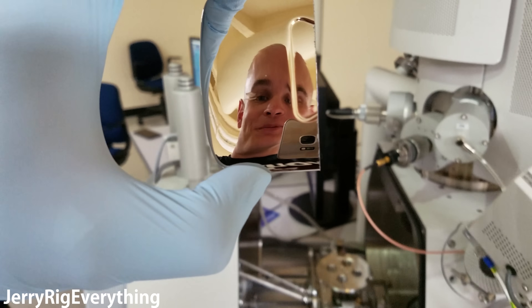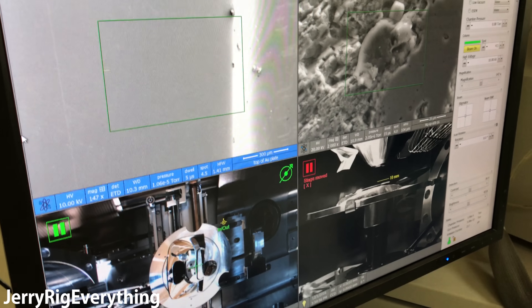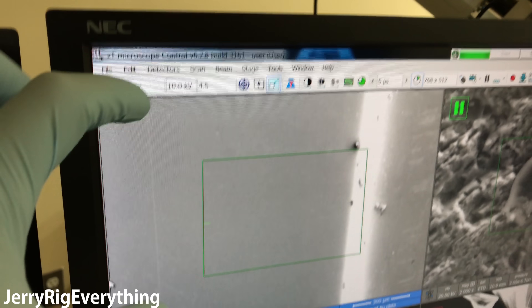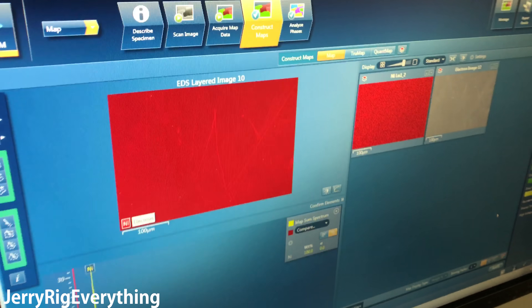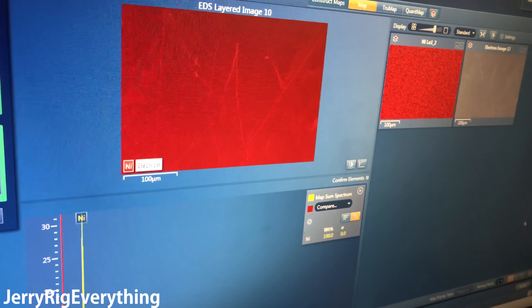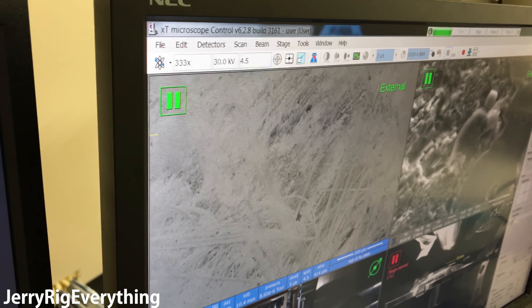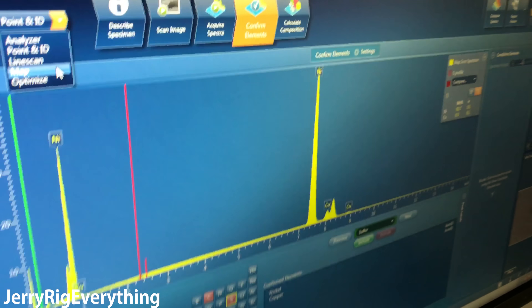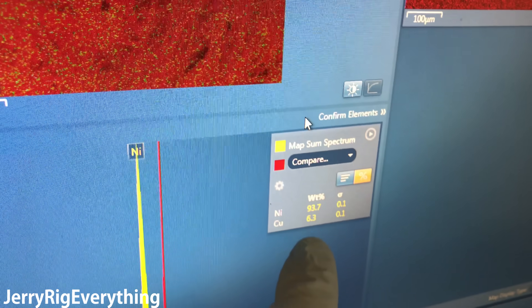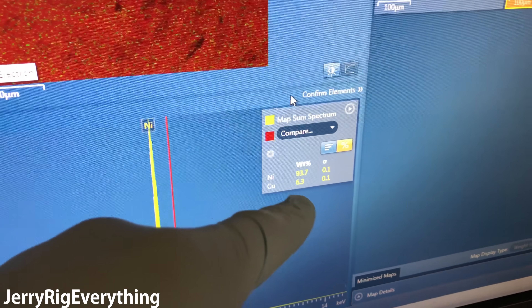Now we're going to check what the silver button is made of — into the machine it goes. With the silver play button inside, you can see the top-down view, side cross-section, and magnified image. The reading shows 100% nickel on the surface of that play button. Zooming in on a scratch, we can see some copper inside as well — copper is 6.3% and nickel is 93%.